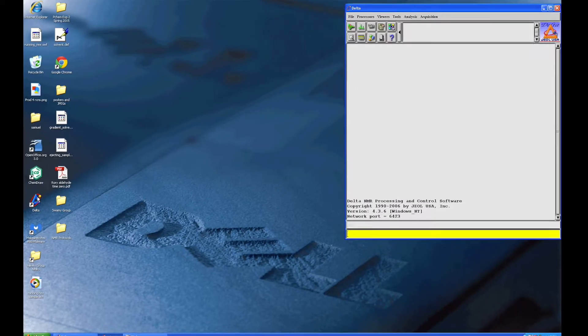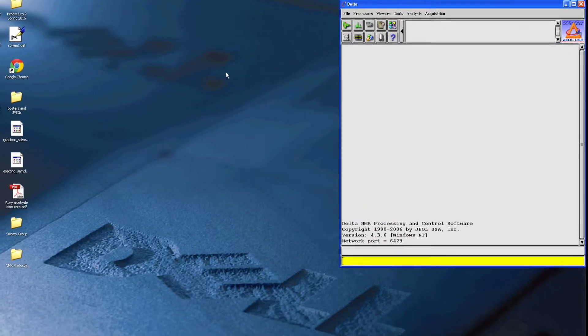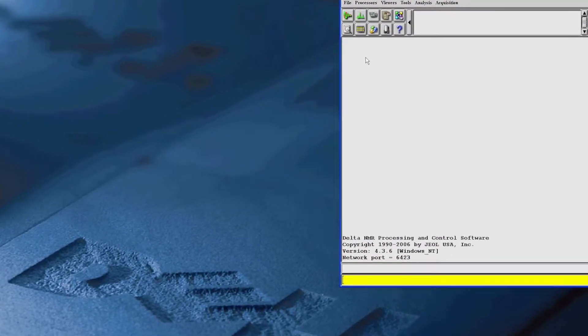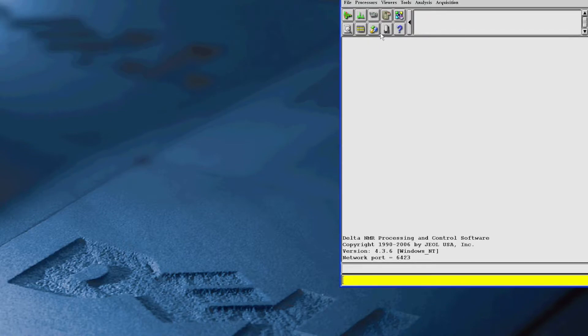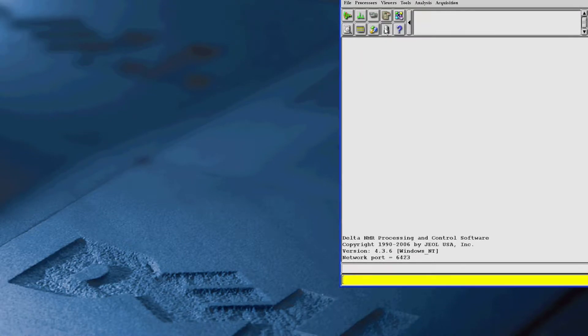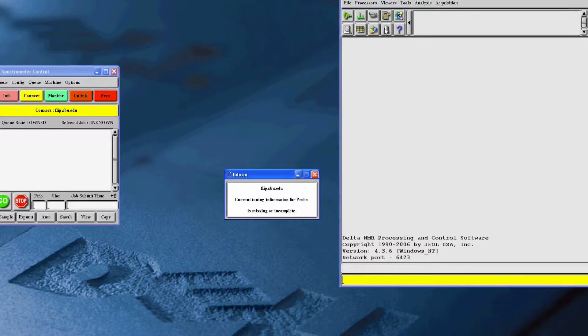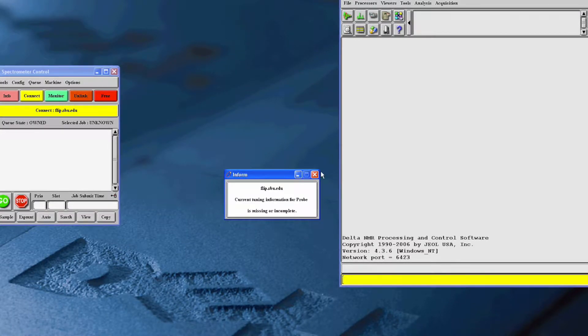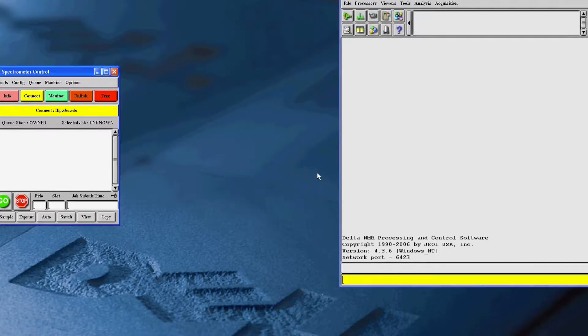First, open the program, and now click on this button called Spectrometer Control. This will bring up the Spectrometer Control window.